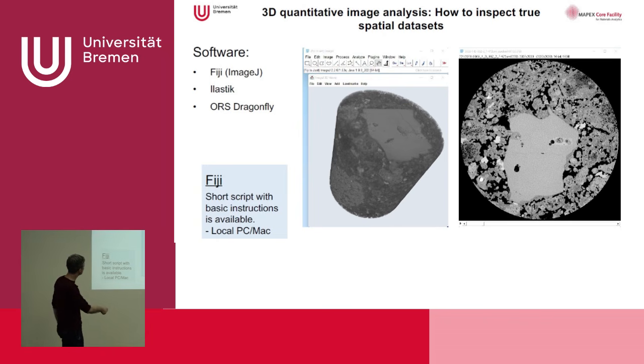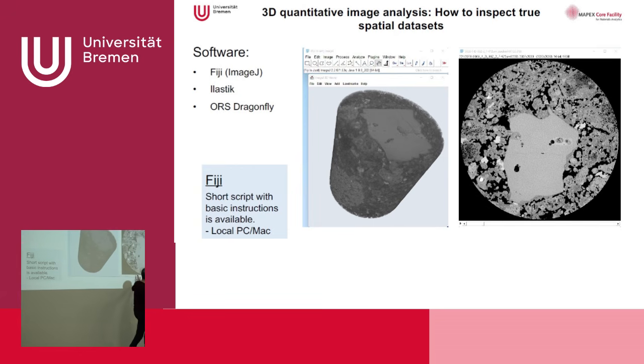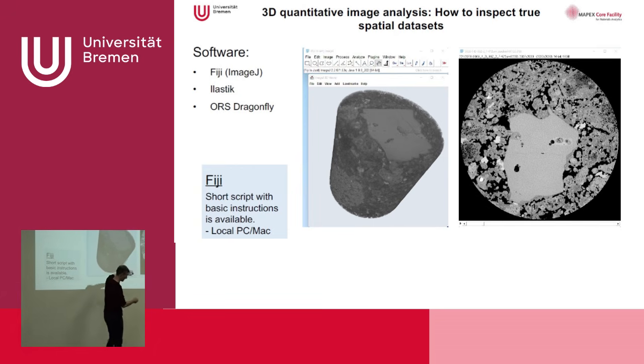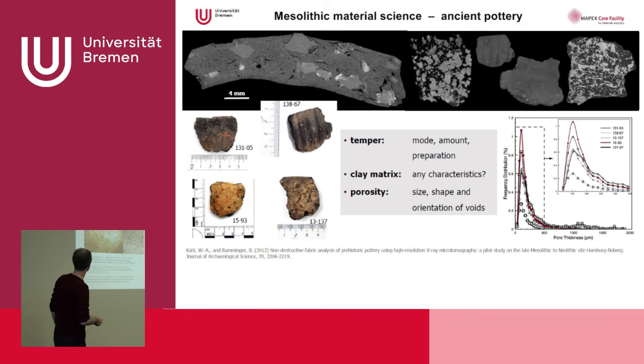And what you can do, you can really have this kind of virtual drill core, your sample, and you can scroll through it. You see, here's a slider, you can load all the images, you can scroll through it, and then you have some first ideas. And this was actually what I was doing years ago when I was a bit younger. We used to inspect micro borings from worms in whale bones.